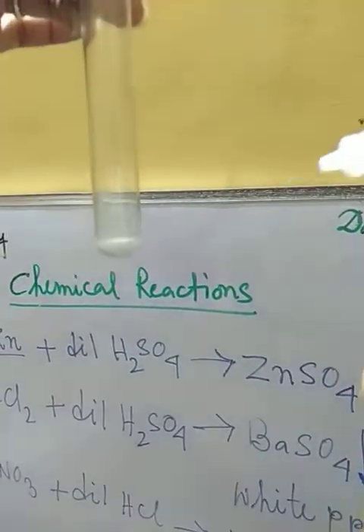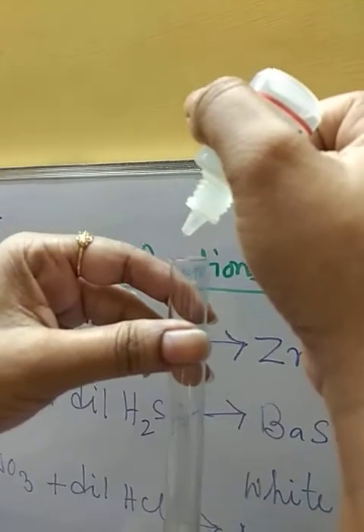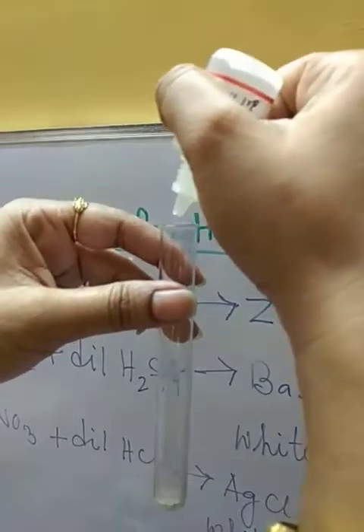I have added just one drop of it. Have you seen the white precipitation? Few more drops we can add.